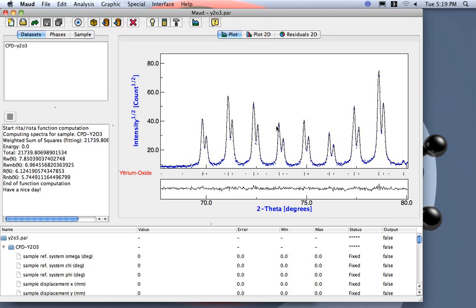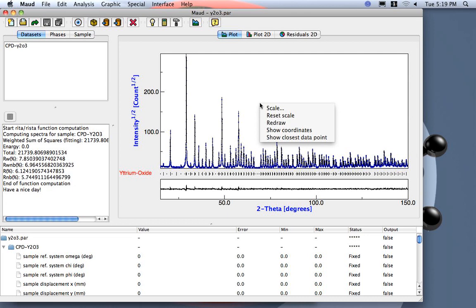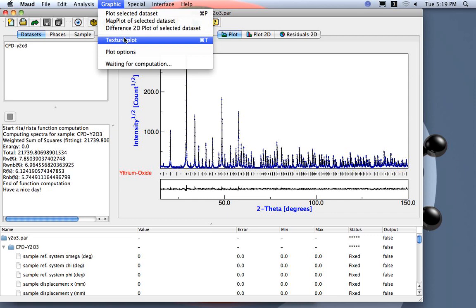I can click and drag and zoom in. Double click I can zoom out. Or if I press the right mouse button I can see for example here the coordinates.